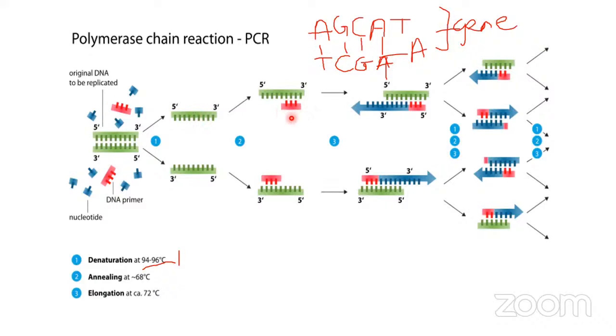We'll now look for a complementary sequence on the natural DNA that we have separated, maybe from your sample, and then bind with the complementary sequence. So for this strand, the primer is also in the form of forward and reverse, just like your DNA is in 2. So the other side of the primer will also come to this 3'. This is 3', this is 3', this one goes this way, this one goes this way. And then the second part of the primer will bind to the second strand of the DNA. You see what happens, the red and the green.